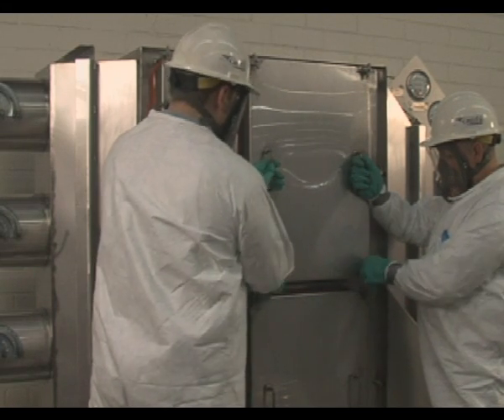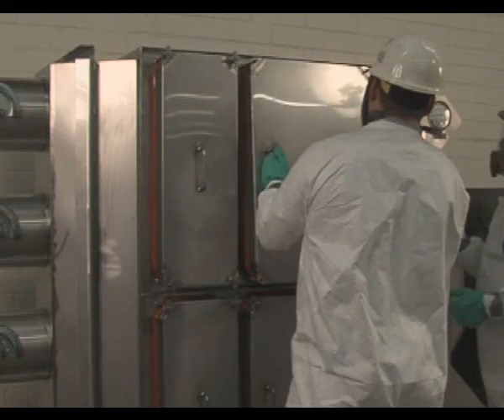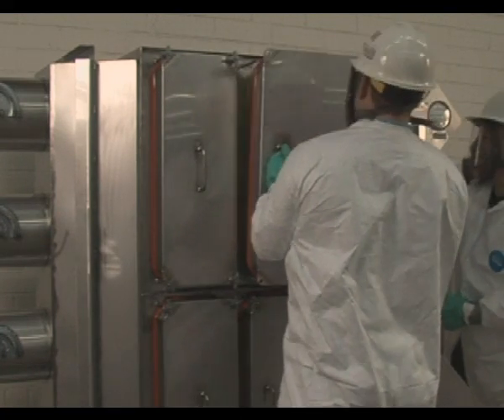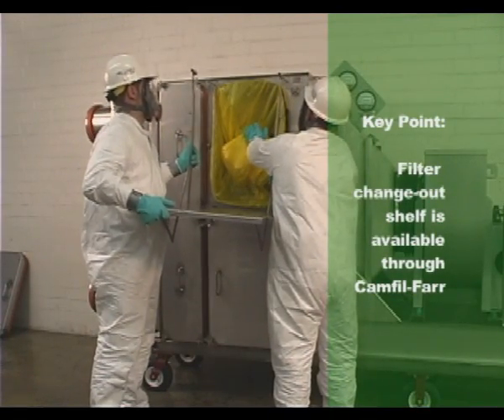Gain access to the inside of the filtration housing by removing the housing access door. Pull the access door straight towards you to remove. Place the access door in a safe location out of the way until the filter change out is complete.